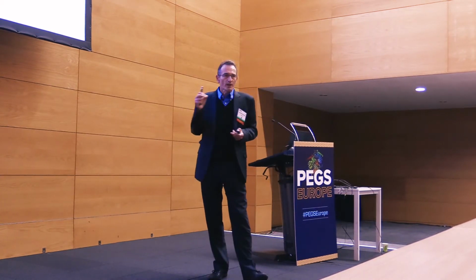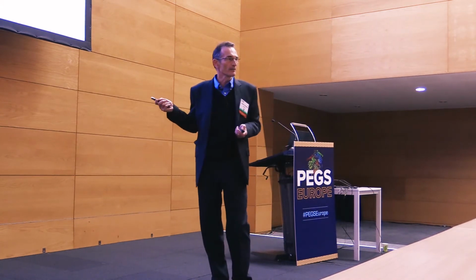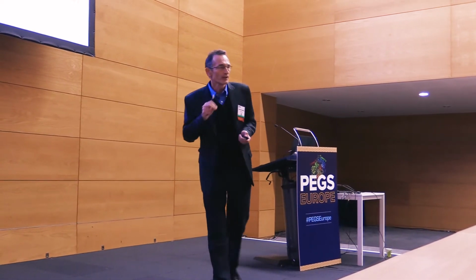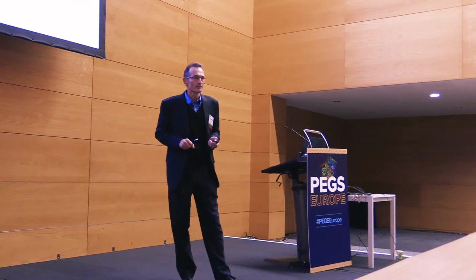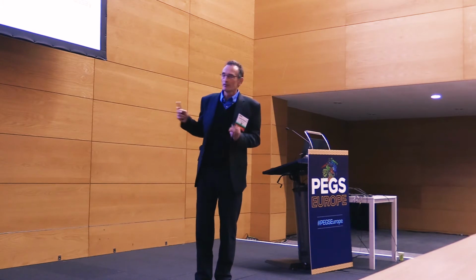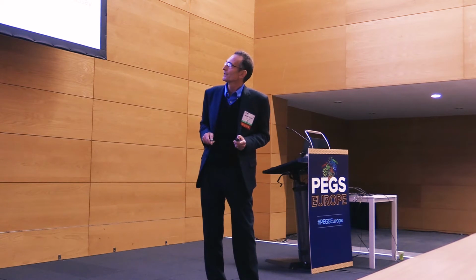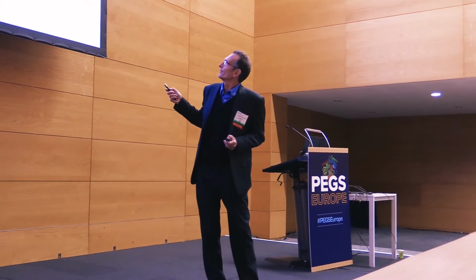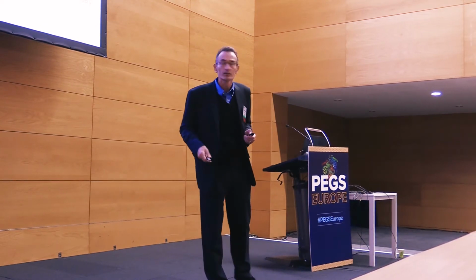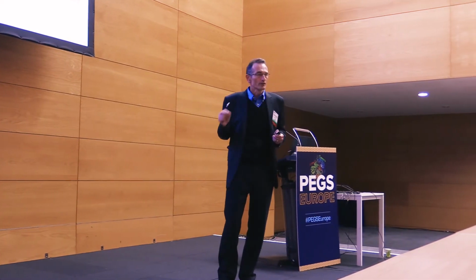If you color code those so that you've got bad ones in red, and when I say bad, what I mean is these are biophysical liabilities defined as the 10% worst among approved antibodies, then the blue ones are the good ones. It's obvious that there is a spectrum here, but for the purposes of choosing a scaffold, we went with blue and red here. These are ranked now in terms of the number of red flags. The worst antibodies down here have 8 red flags, and the best, as you can see, approximately about a third of them, a third to a half, have 0 red flags.